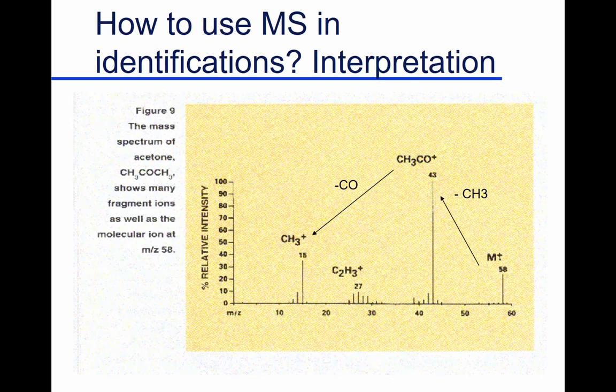In terms of identification, we've got both a curse and a blessing. Today we have nice mass spectral libraries. The mass spectrometer is set up so that you say, I want to know what this is. You put the cursor over it. It takes a look at the fragments, the mass display of whatever happened to be coming out of your gas chromatograph or LC right there. It takes that fragmentation pattern and searches all through its library and says, this is the best match. It's this good, best, second best, third best, fourth best. So that's a blessing and a curse.